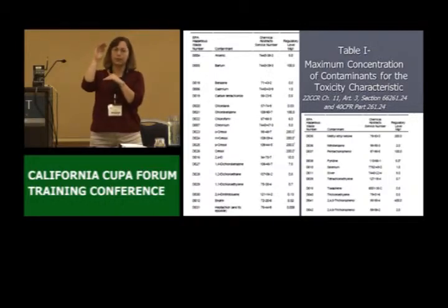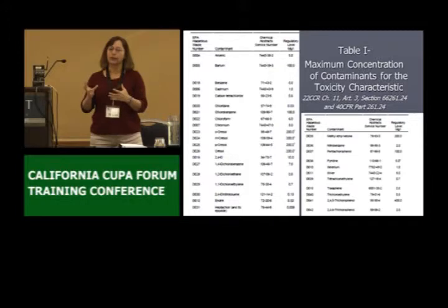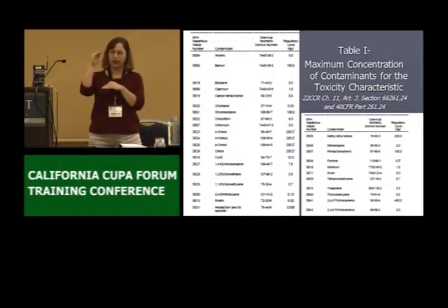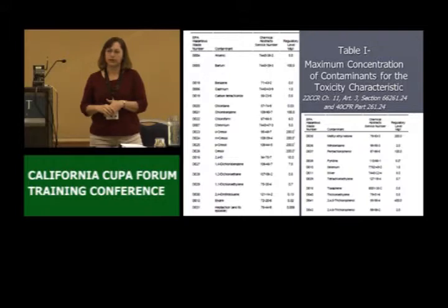So your results are going to be based on the volume, milligrams per liter. All the regulatory limits for TCLP are in milligrams per liter, so that's how we're going to report it to you. It's no longer milligrams per kilogram. This is just how much came out of the sample and went into the solution. It may not be 100%. You may have something that's just not very soluble, so it's not going to go into solution. That way you get your TCLP results, and that's supposed to mimic what happens if it goes down potentially into the groundwater.